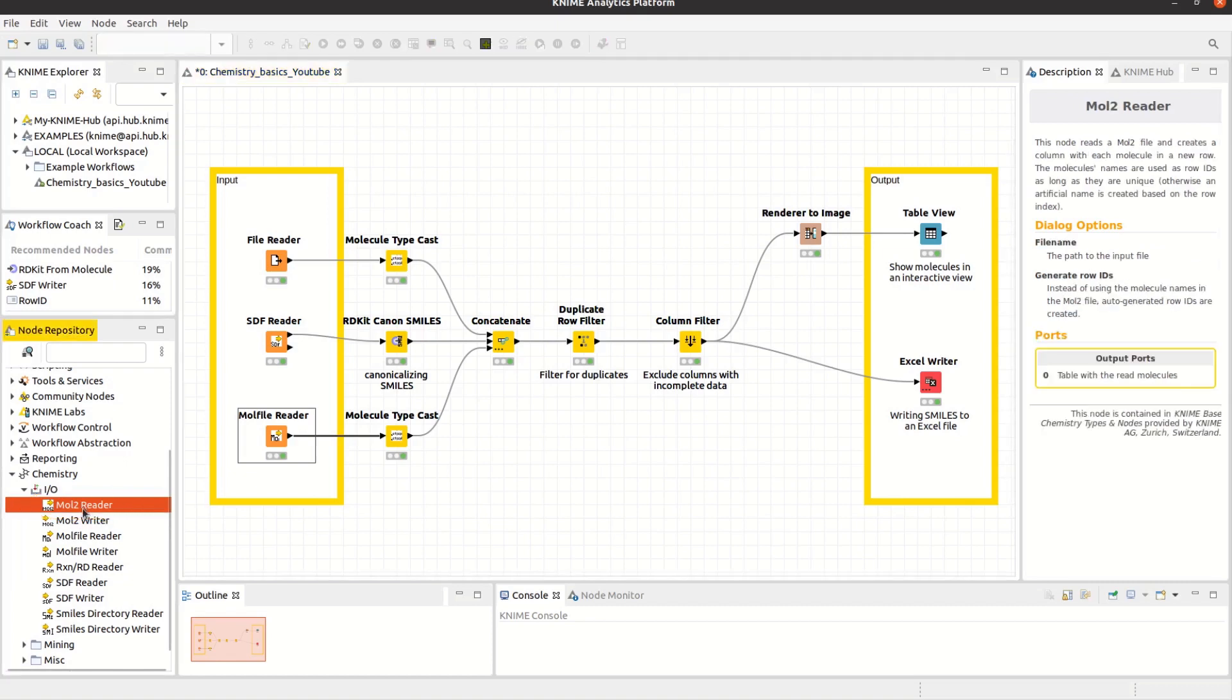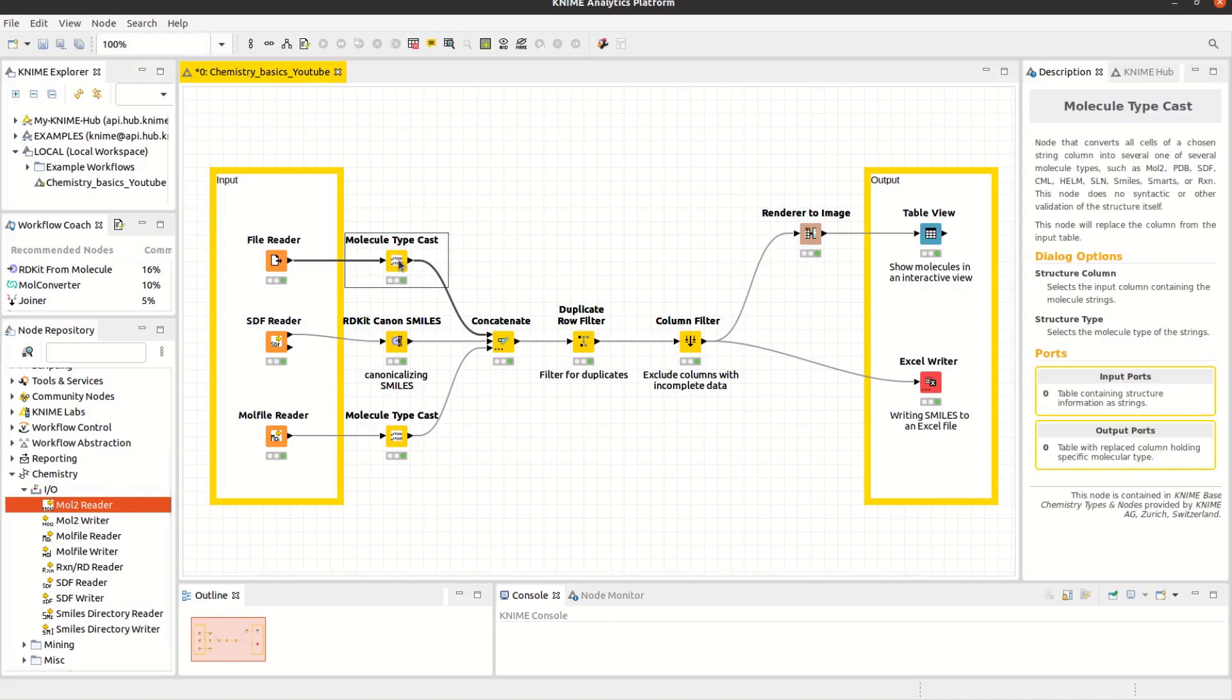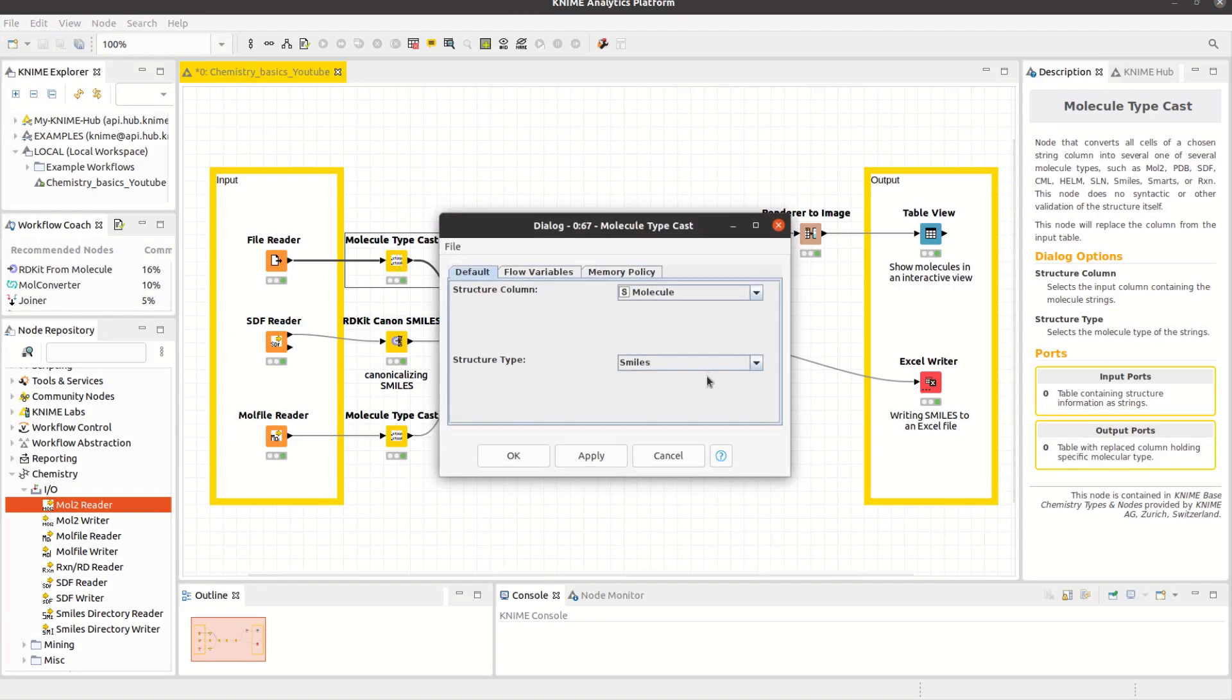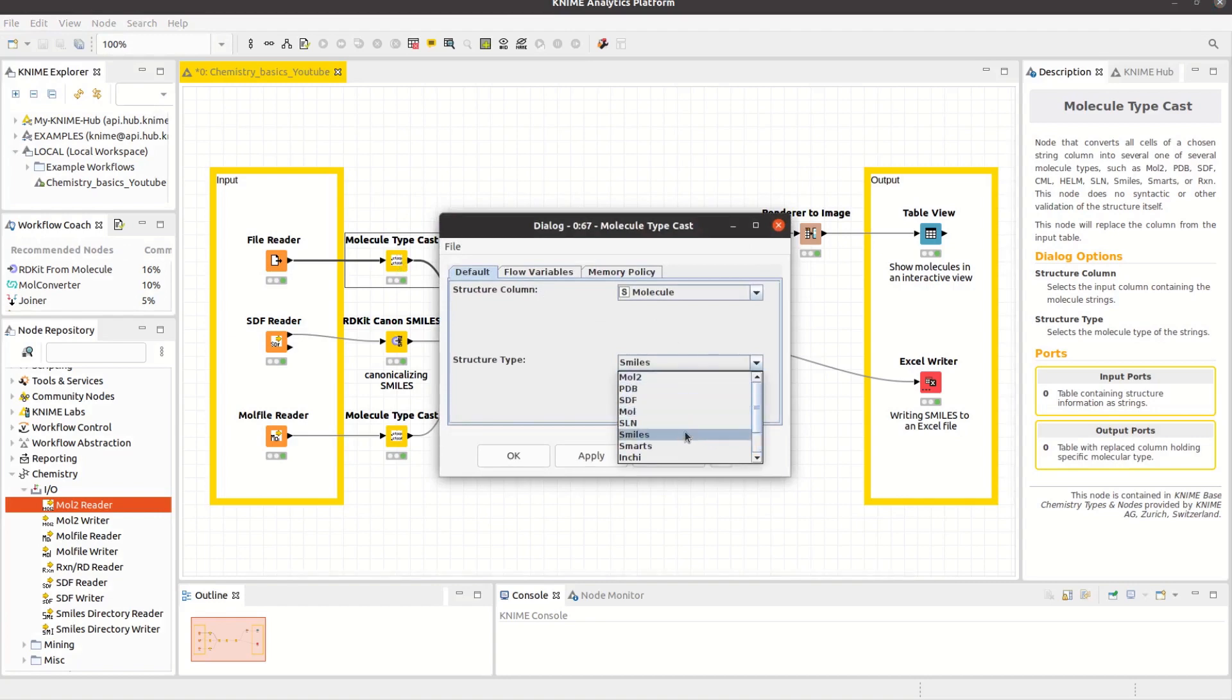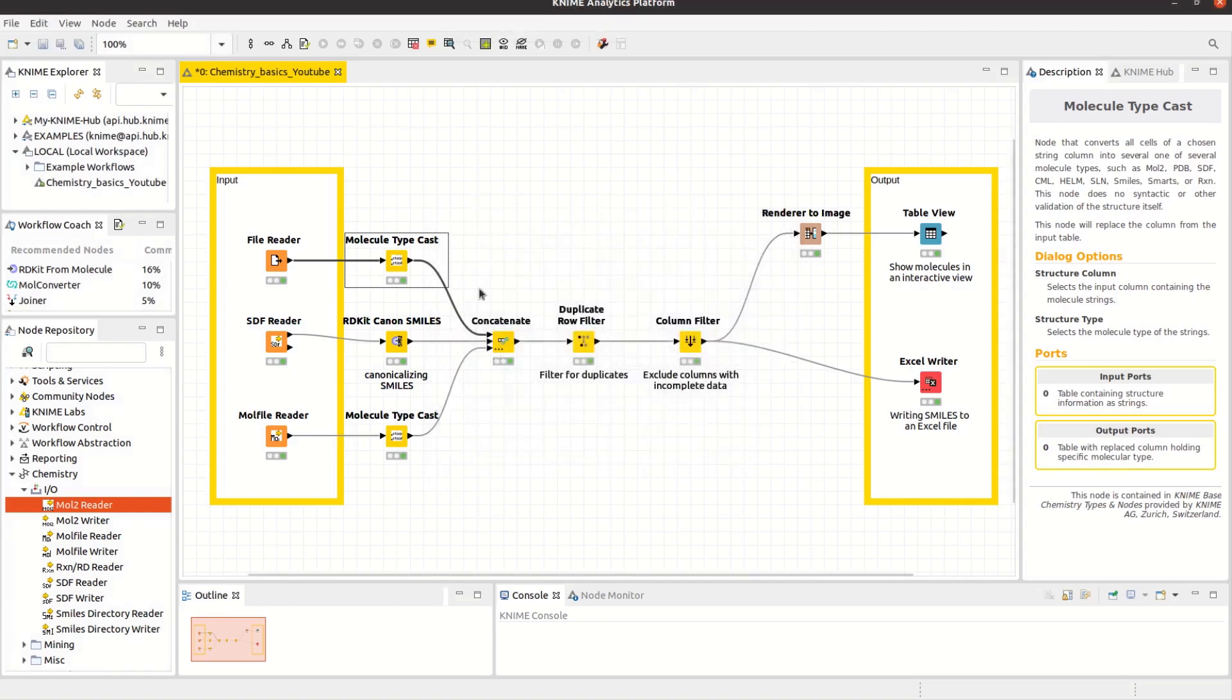If you have chemistry data in a KNIME table, but it's in cells of the wrong type, you can fix this using the Molecule Typecast node. It can change the assigned data type of a column from string to other chemistry types, such as MOL2, SMILES, or SMARTS. Note that this doesn't modify the data in the cell or do any chemistry translation.